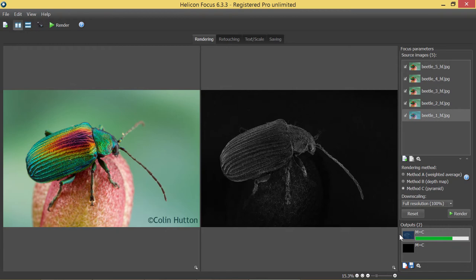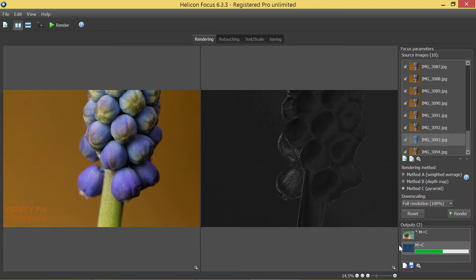Now let's take a step forward. I want to show you a feature of Helicon Focus that I personally find extremely helpful.